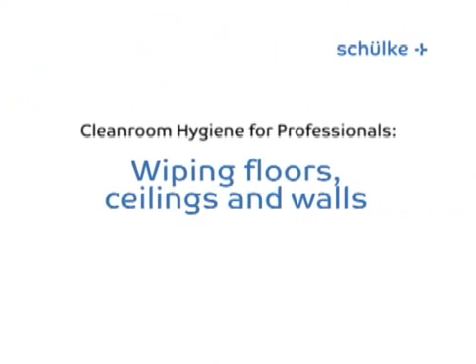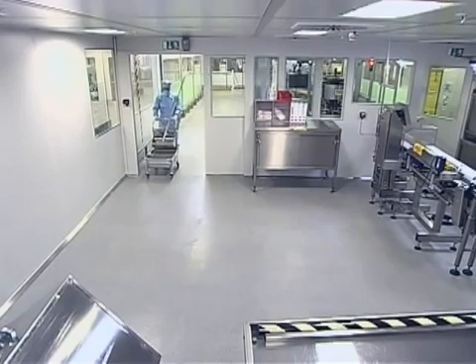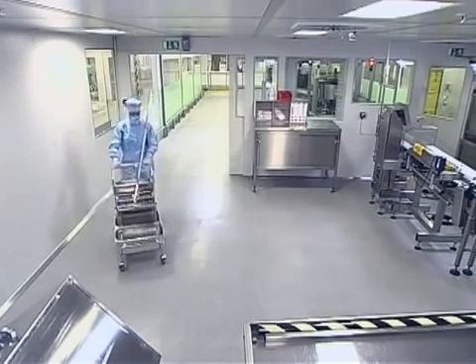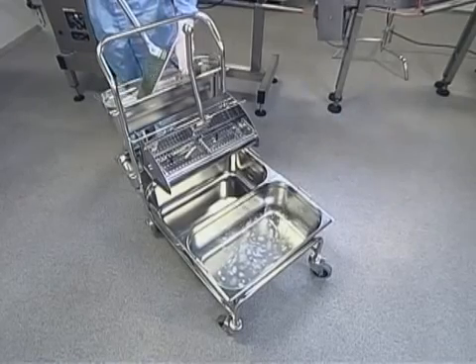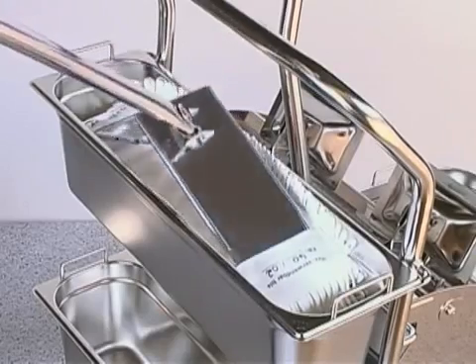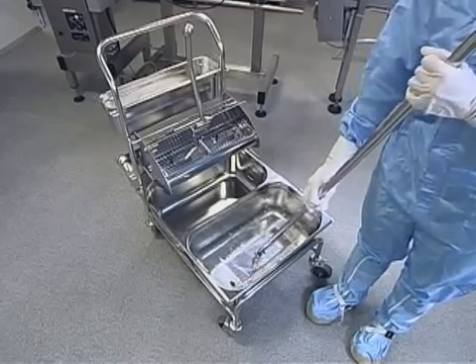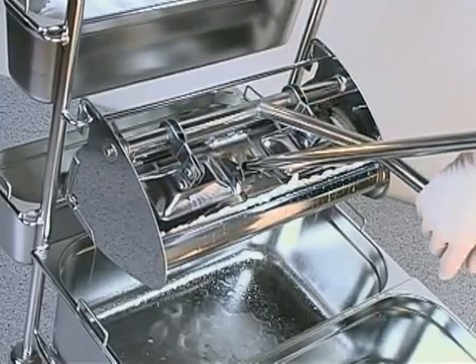Now one of the most important chapters: how to correctly wipe floors, ceilings and walls in a clean room. If you enter a clean room, you should position the cleaning system trolley so that you need to move it as little as possible. Now use the mop holder to take one of the mop heads out of the upper bucket of the trolley, if possible without touching the mop head with the fingers. Soak the mop with in-use solution in the front bucket and squeeze the mop out using the mop wringer.